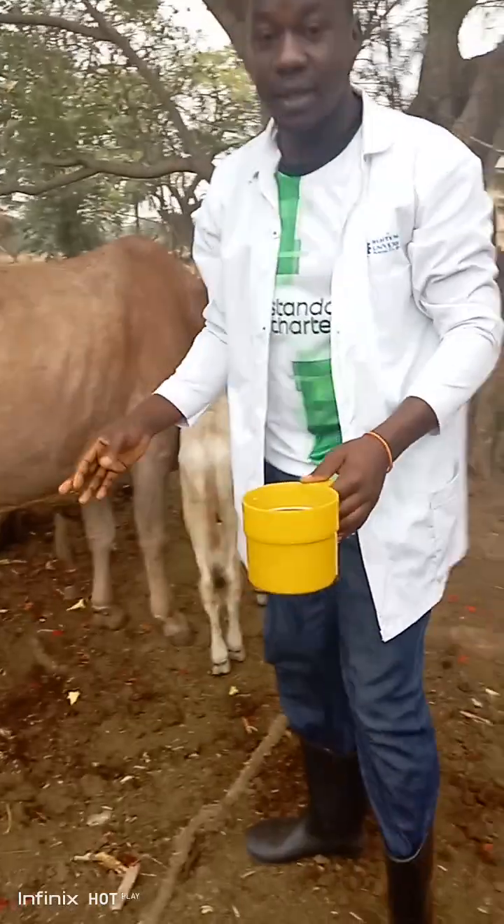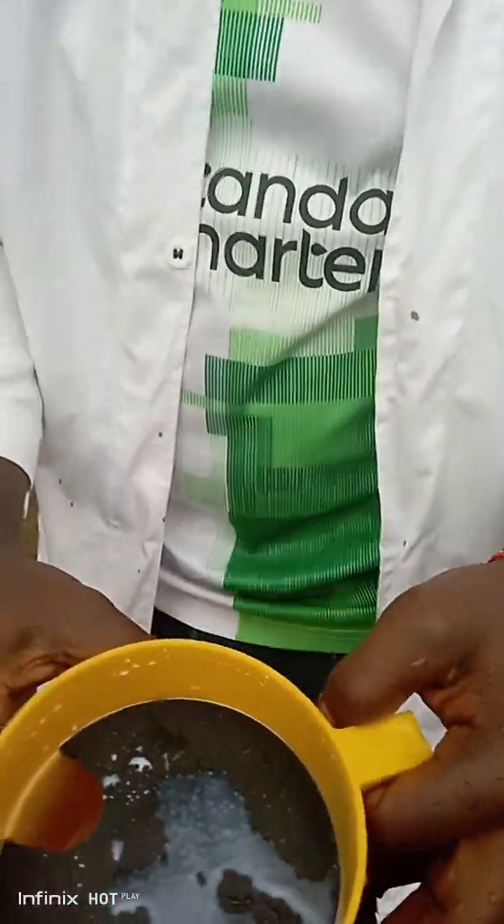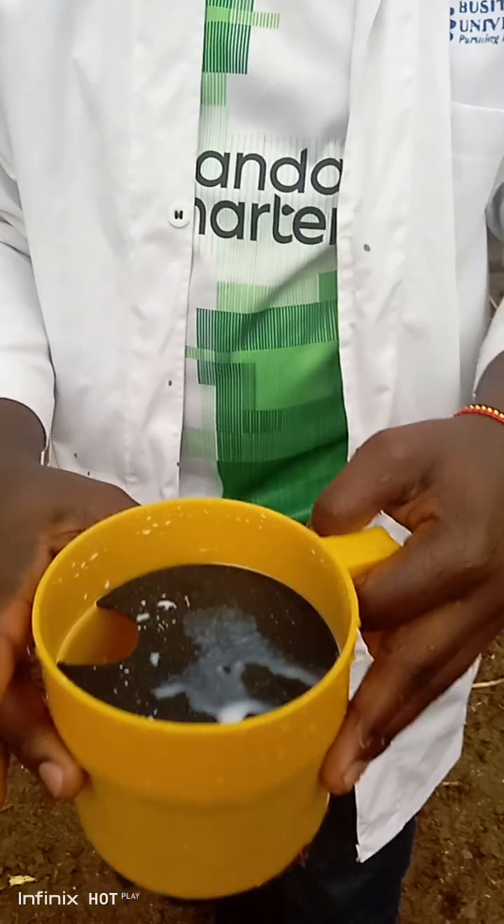So I am done, and as we can see, we observe that our animal is free from mastitis.